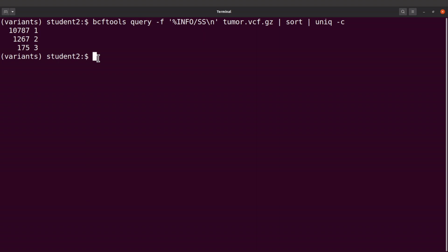Perfect. So now we've done some statistics. As the saying goes, a picture is worth 1,000 words. Visualization helps us to easily interpret and understand our data. So what we are going to do is visualize these statistics, the values that we have generated. To do that, we are going to use R. So I want you to also open your RStudio, and then we will visualize. We are going to generate pie charts and then bar charts. So let's continue with that.